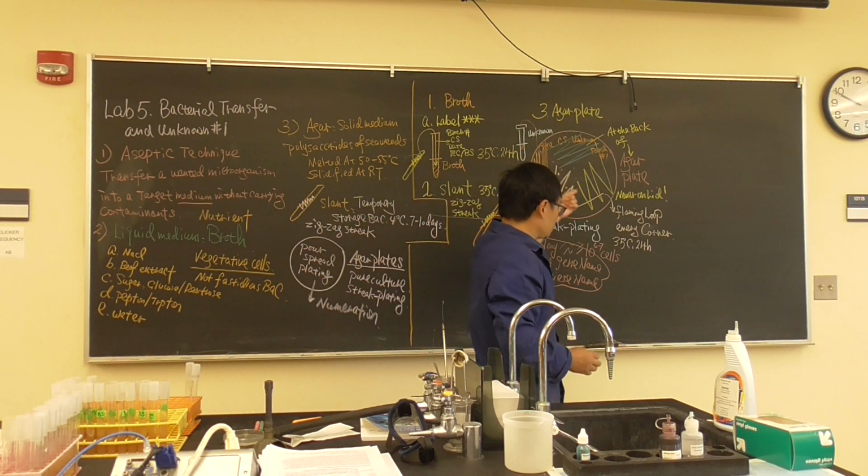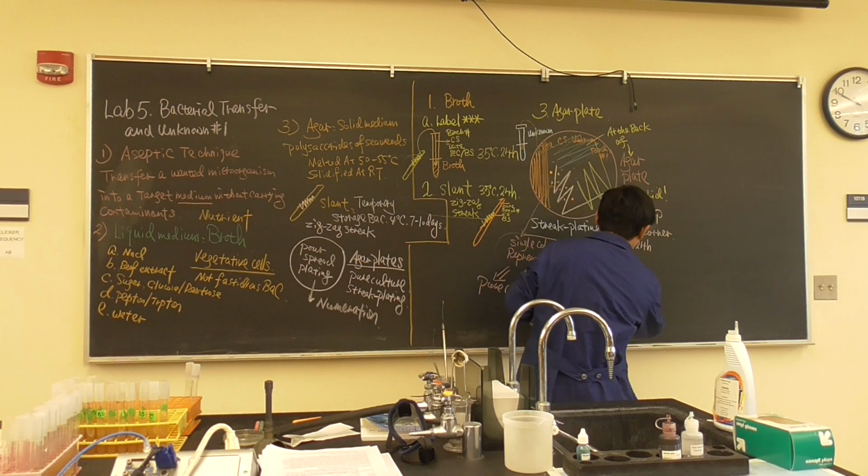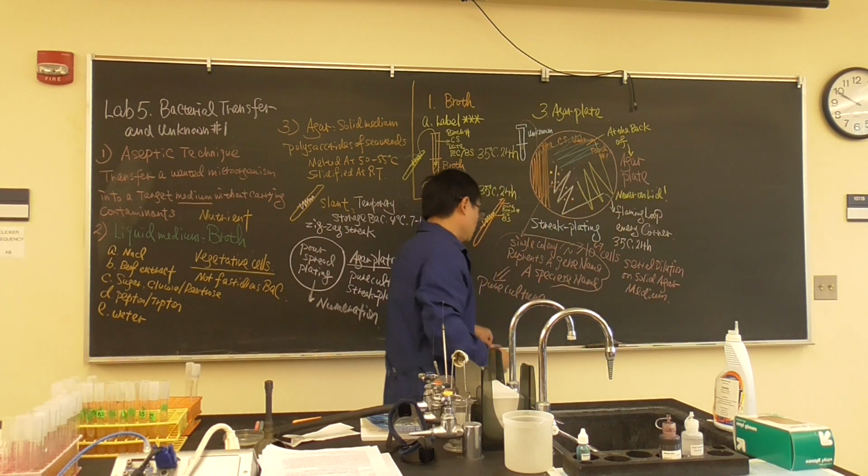Now, streak plating is very important because, as we always say, it's like serial dilution on solid agar medium.